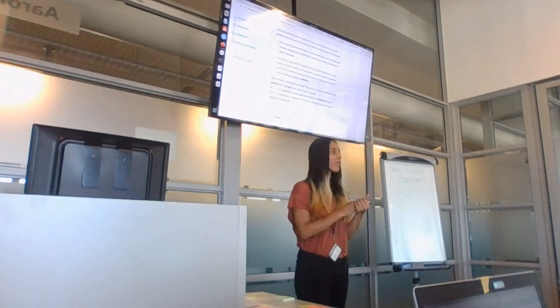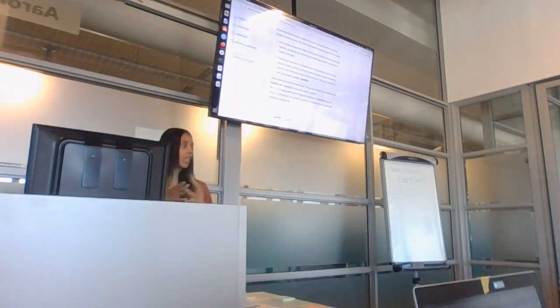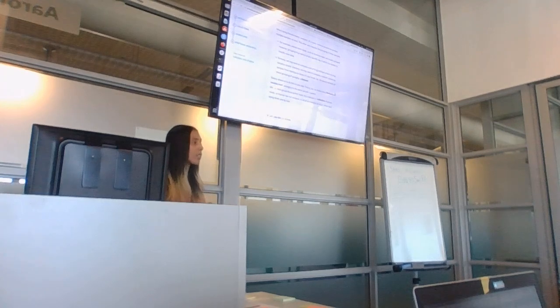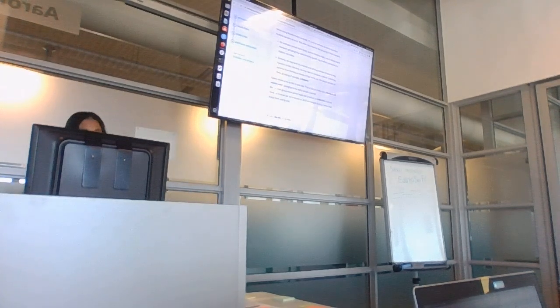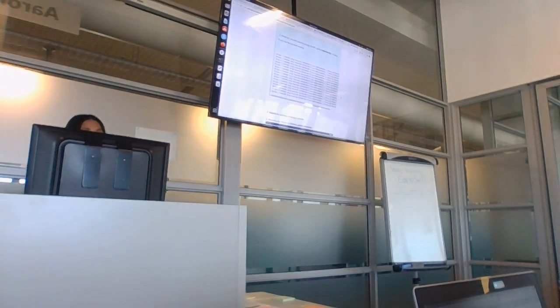Instead of doing the analysis on one file at a time, if the tool can accommodate it, because not all tools can, you could direct it to a directory and say process or run this analysis on all the files in there. So that would be one reason why you want to put them in a dataset besides organization. So in Galaxy, you can do two steps at once.